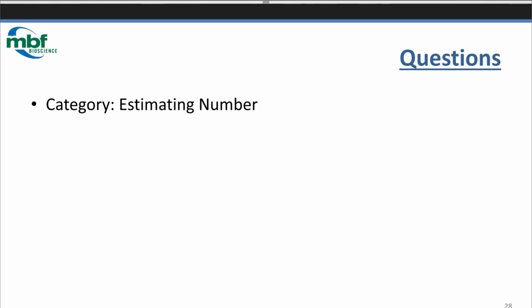So we're all facing this. TIFFs are getting bigger and bigger. You can use JPEGs, which are compressed. Those are good to use, but those themselves are pretty big. We have a version of our software coming out, especially with our program NeuroLucida 360, which is going to do much better handling these big versions.